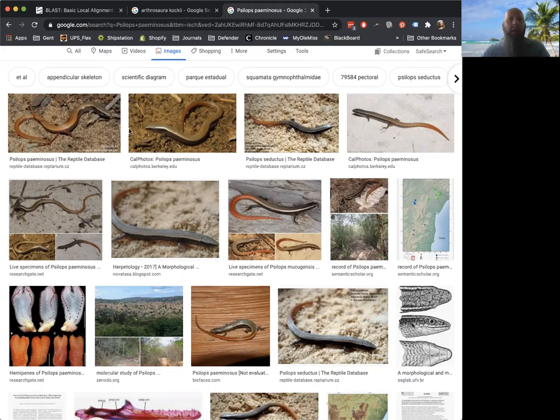Okay, I'm going to explain to you how you can use publicly available databases of DNA sequences in order to identify species. And this is part of our first portion of our lab exercise for Lab 6 in genetics. The example I'm going to use is one in which someone told me that they were traveling to an area in South America and saw an interesting lizard that they tried to catch. And all they were able to get was the tail of it.